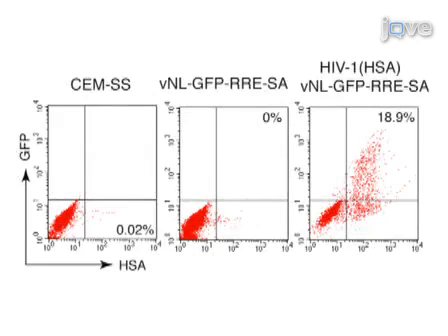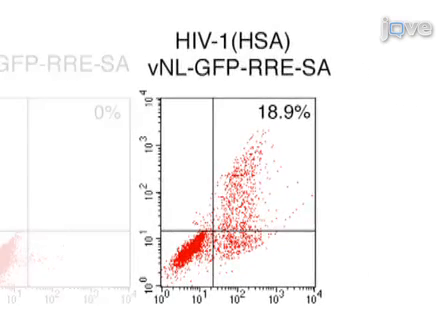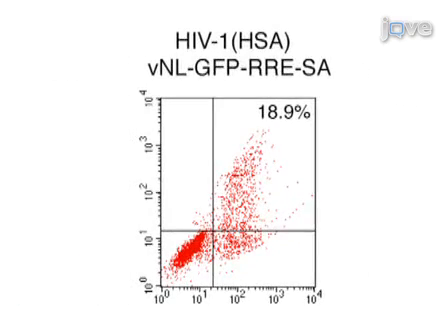The final step is to identify HIV-positive cells by measuring GFP-positive cells by flow cytometry. Ultimately, results can be obtained that show the percentage of GFP-positive cells through flow cytometry.